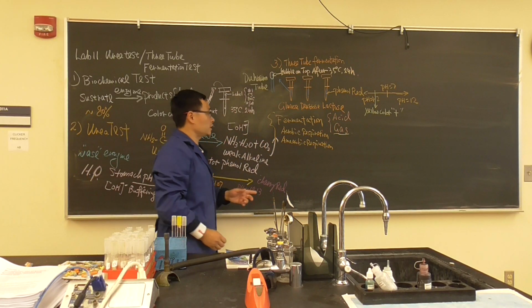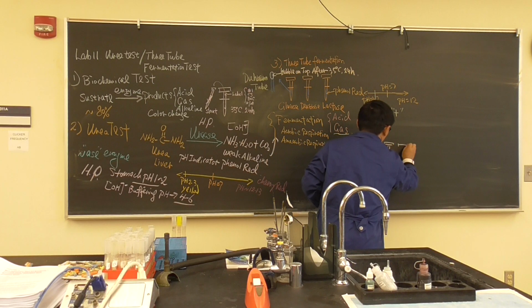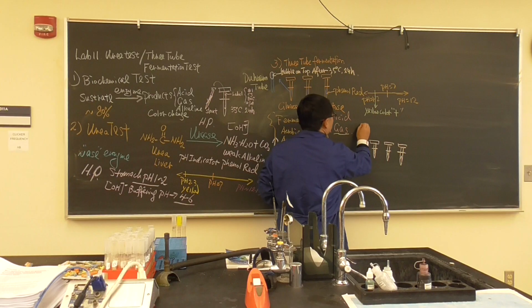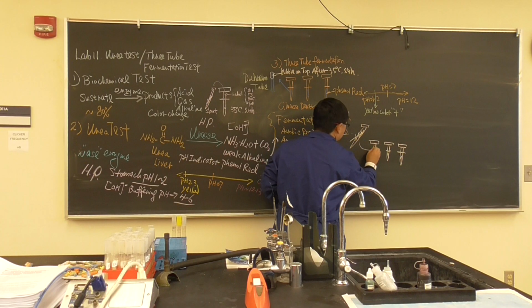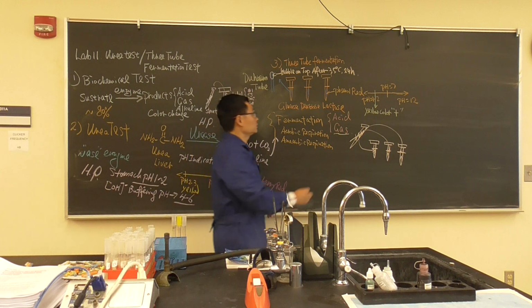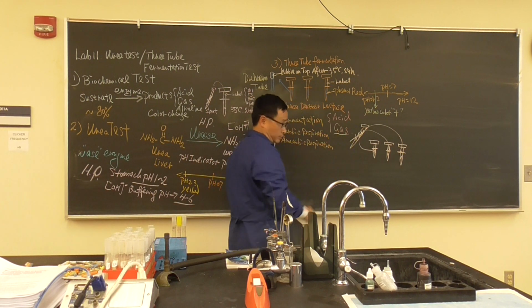So what do you do today? The same thing. Those 3 tubes, you inoculate, you assign the culture. What should we not forget? Label on the top.